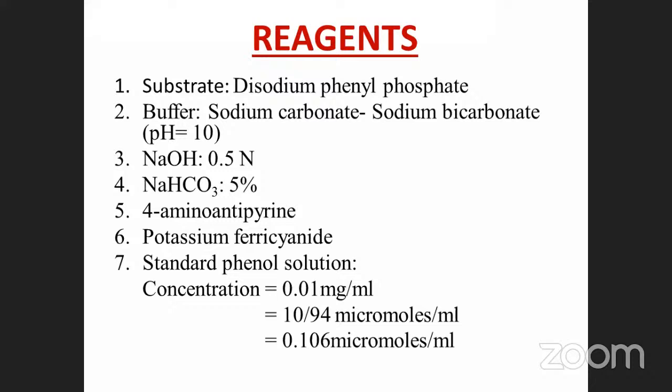That's what is called a standard. And the standard reacts with the same chemicals to form color products. With the standard, we will get two readings: concentration as well as optical density. Okay? And the concentration is 0.01 milligram per ml. How to prepare this 0.01 milligram per ml?